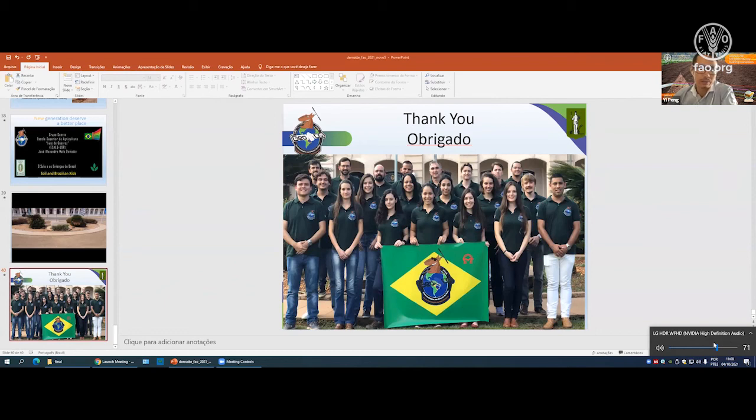I think from the QA box, you also can see it by yourself, but I will read it out because the recordings will not show the QA box. So for later on, if anybody wants to watch the video recording, they will also know the questions. The first question is saying, soil sampling is done by many laboratories and persons. Wondering what the error due to sampling from a multi-laboratory database is and whether it's addressed within the model. I think it's mainly talking about this random error from different laboratories or by the people.